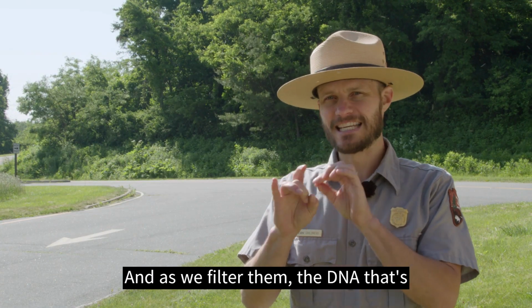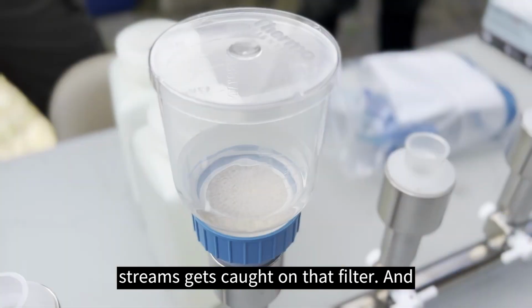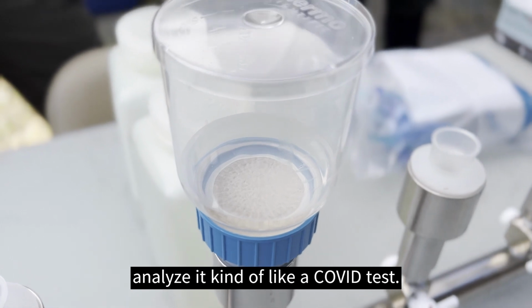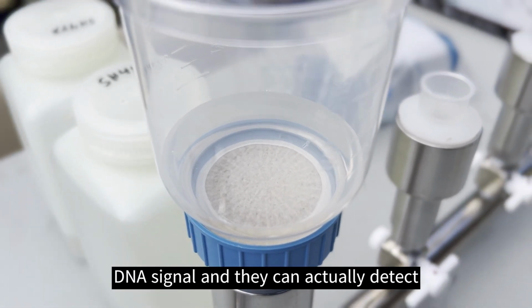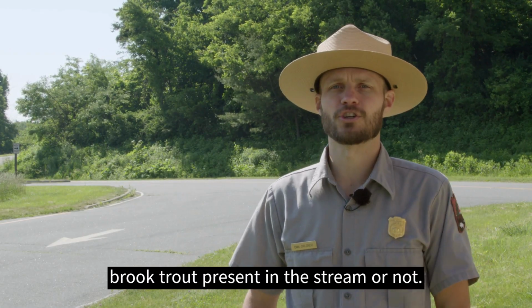As we filter them, the DNA that's floating around in the water, in the streams, gets caught on that filter, and we can send that off to a lab that will analyze it, kind of like a COVID test. They use PCR to amplify the DNA signal, and they can detect at very low levels whether there are brook trout present in the stream or not.